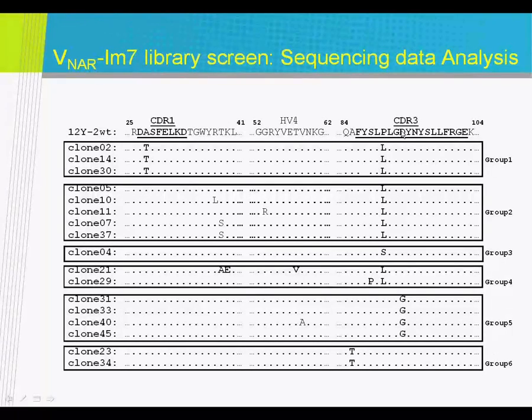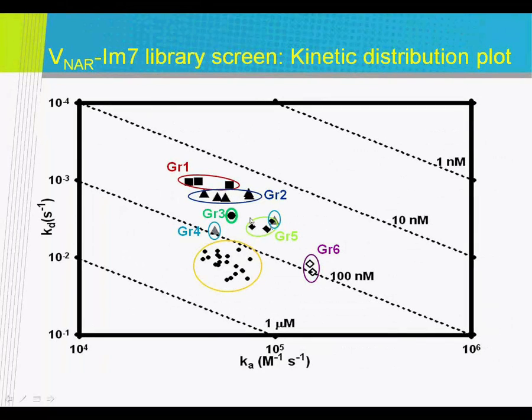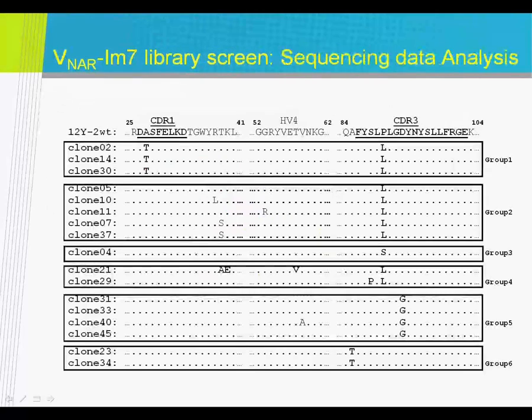So just to summarize this work, the DNase E7 immunity protein 7 interaction is very well suited to capture various antibody fragments onto the DNase E7 sensor chip surface.